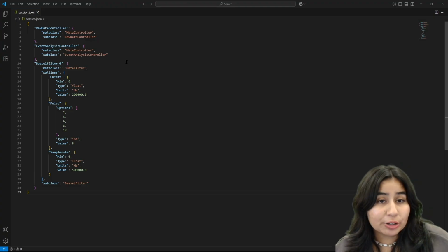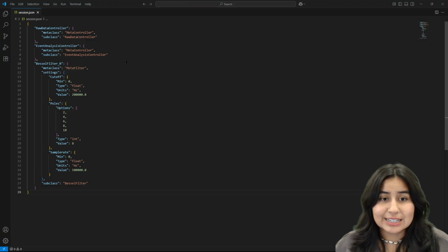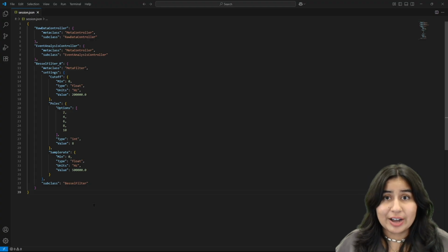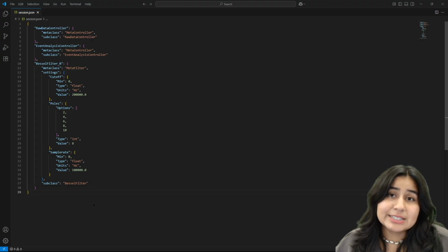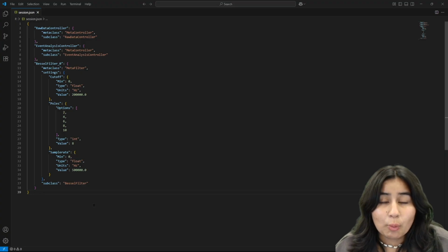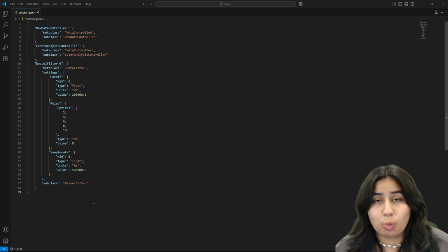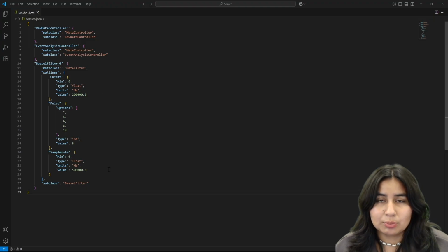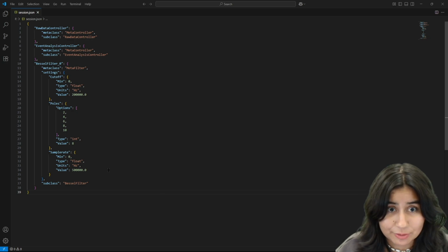Additionally, some important tips regarding sessions is that, well, first of all, definitely you have to make sure that all of the files are in the place they were when the sessions were saved. Otherwise, if you try to load it just won't load correctly, if at all. We will later on see why that is, but a lot, if not most of the elements are depending on one another. So if one is missing, then the other ones will fail by default.